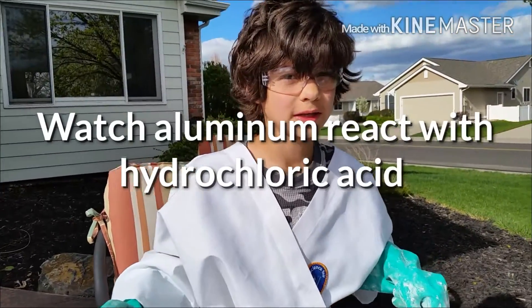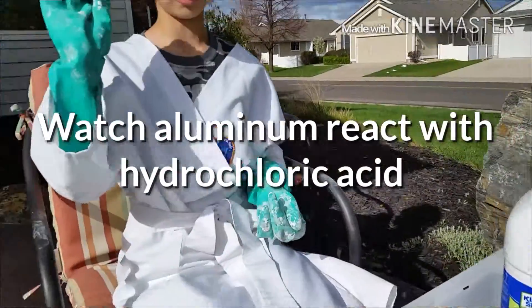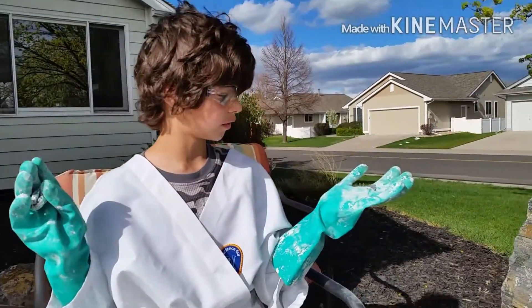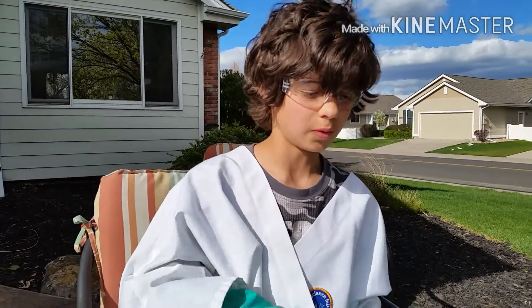Hey guys, today we are going to be mixing hydrochloric acid with a metal called aluminum. I got this one from foil and this one from my foundry, and we're seeing which one will react more violently and which one will not.